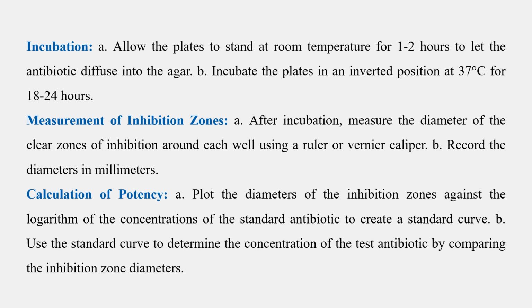Measurement of inhibition zones. A. After incubation, measure the diameter of the clear zones of inhibition around each well using a ruler or vernier caliper. B. Record the diameters in millimeters.